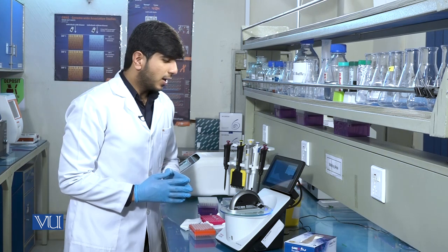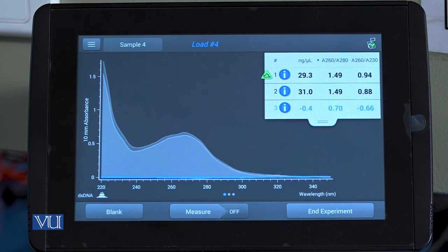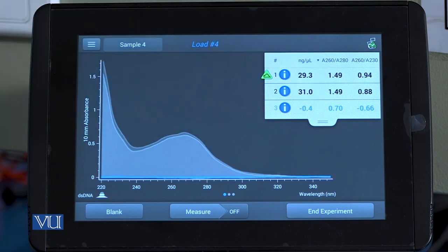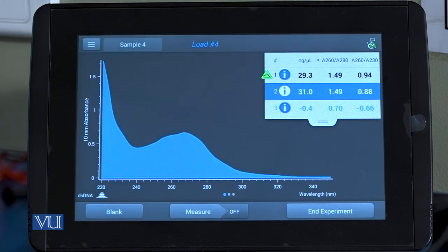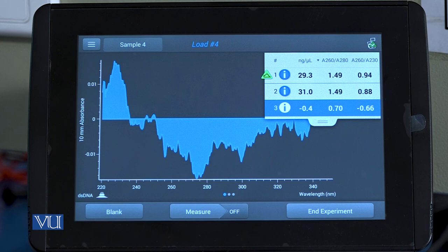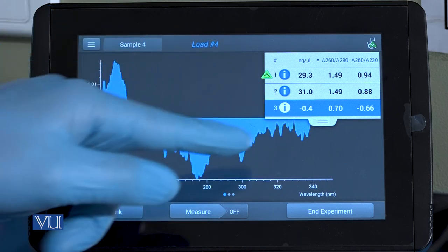So in this case, you can see the values on the Nanodrop instrument. We can clearly see the difference between the peaks of these three samples. In the first sample, you can see there is a sharp peak at 260 nanometers. Likewise, in the second sample, there is again a sharp peak nearly at 260 nanometers. While in the third sample, there is no peak present, which clearly confirms that in the third sample, DNA is not present. So we will not proceed with the third sample for our downstream application.